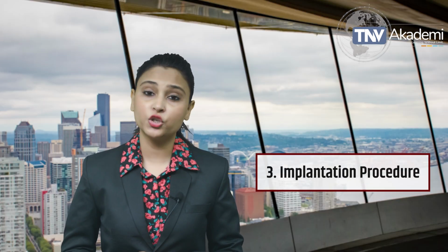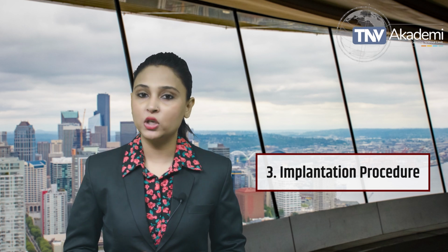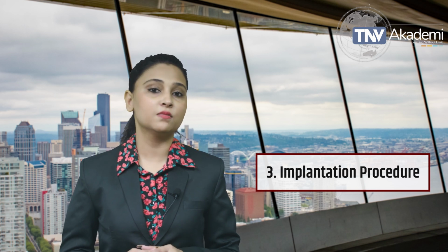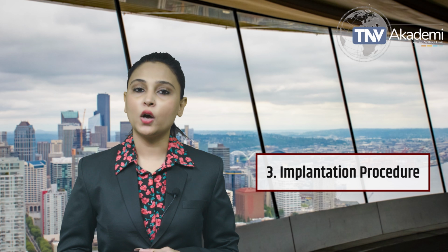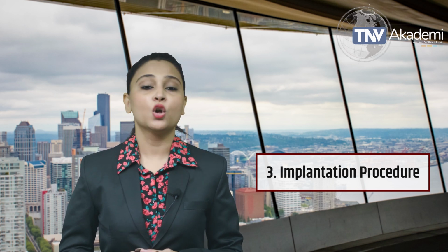Implantation procedure. The material is surgically implanted into the selected tissue following strict aseptic and ethical standards. After implantation, the test animals are monitored over a specified period depending on the intended duration of use of the device, short-term, long-term, or permanent.